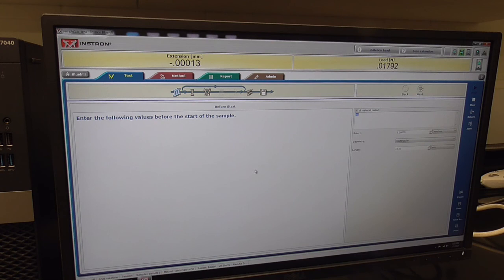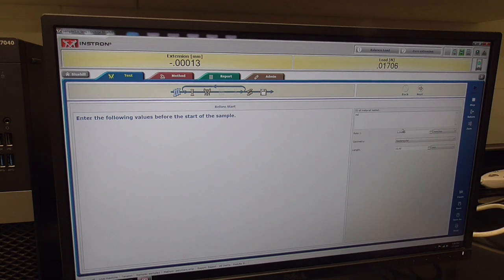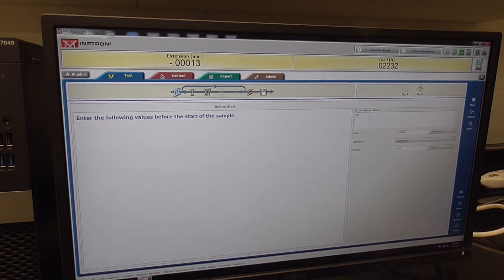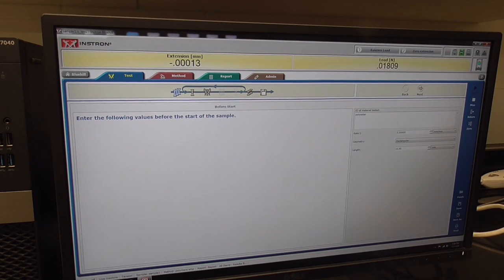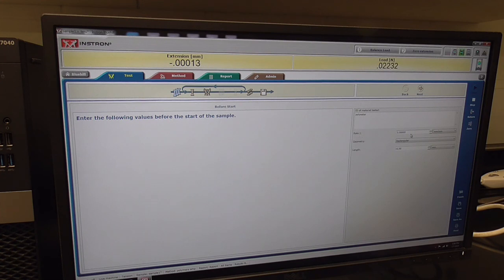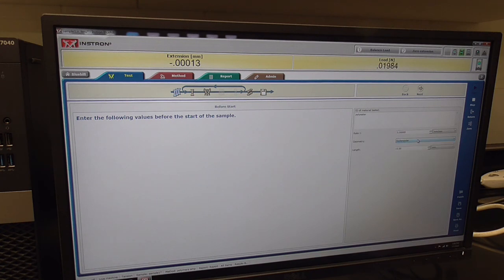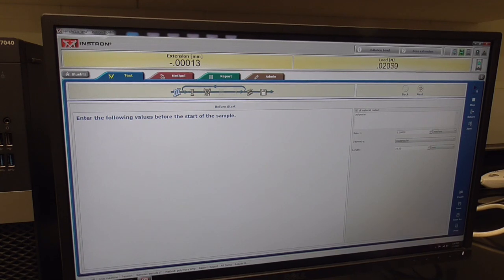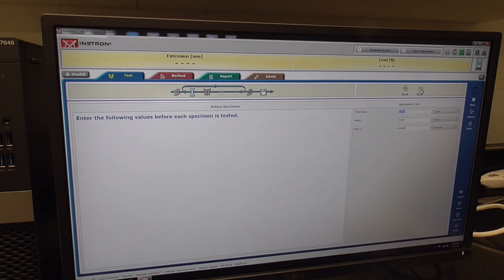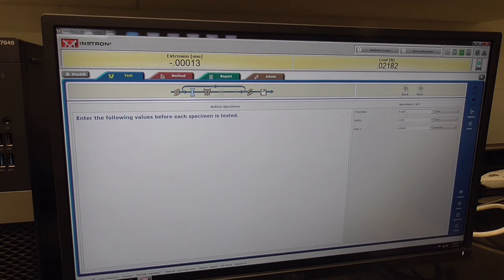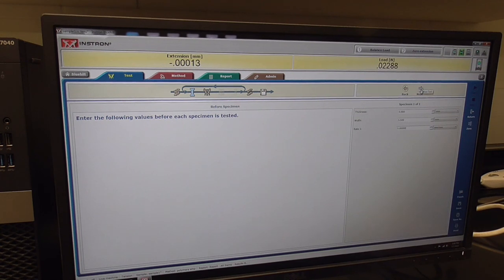The next screen that comes up is values you need to enter before your test. You may want to give it a characteristic ID, such as polyester, if that's indeed what it is. The rate at which the test is going to run is set here at 5 millimeters per minute. The geometry is of a rectangular dog bone and the gauge length should be measured at 16 millimeters. Now I need to go to the next screen. I look for the next button up here on the upper toolbar. Then the method is asking for the length, width, and thickness of the dog bone, which I'll measure and put in here.